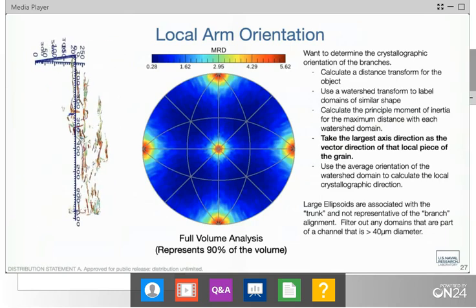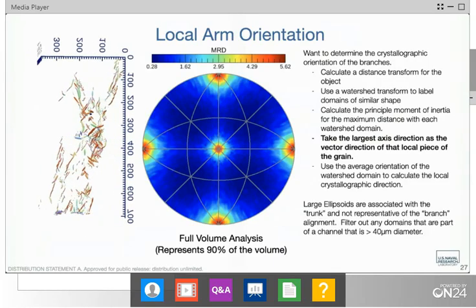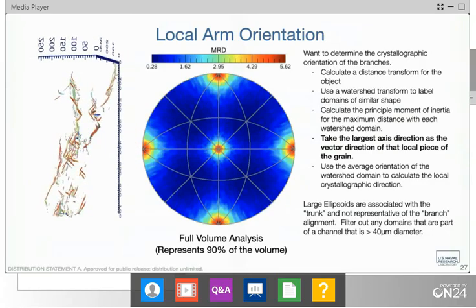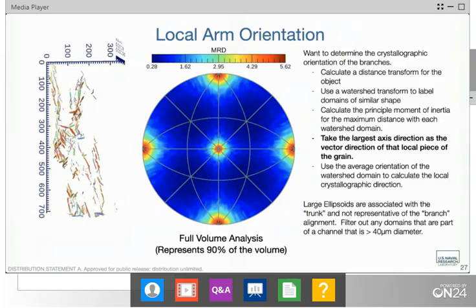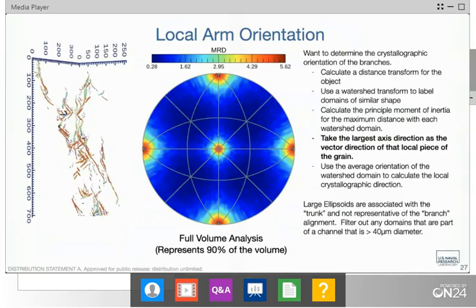We do that through the IR camera on the MIRA, as well as having checks with the EDAX software. So there's a lot of that type of thing happening in terms of making sure that the system works smoothly. And that's not just the EDAX side of things. We are doing those kinds of checks across all the different systems.